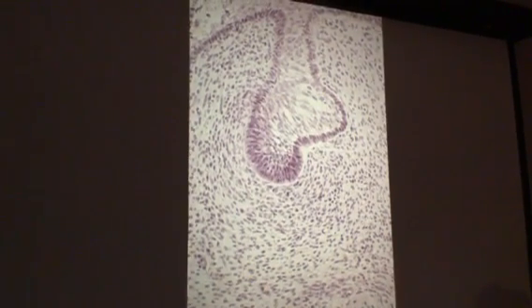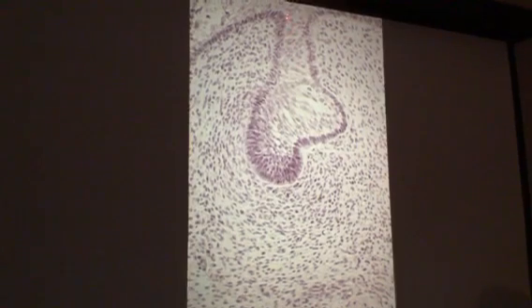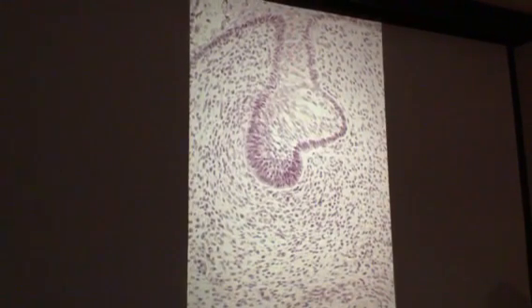Okay. And that right there is what? Dental lamina. Okay, and that's it.